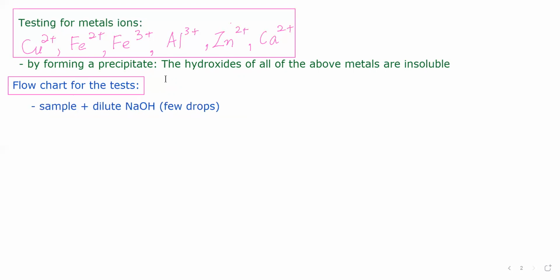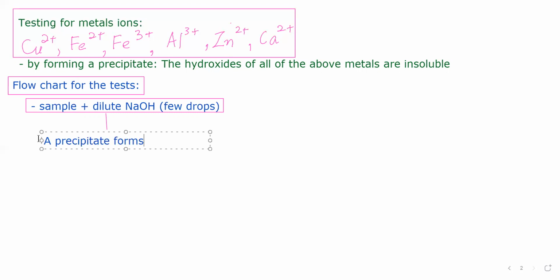Now, when we put the sodium hydroxide into the sample, what is going to happen? A precipitate forms. When I say the precipitate forms, I have to observe it. This is the second most important step.